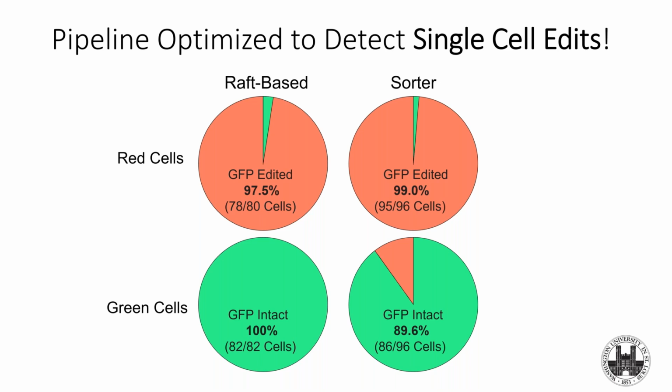We simply can't do those on the cell sorter. And the sorter, best case, you could sort out to 96. Whatever phenotypes you have, you could sort them into maybe 96 wells. But you can really sort lots of different unique phenotypes into as many different plates as you want with the Raft approach.